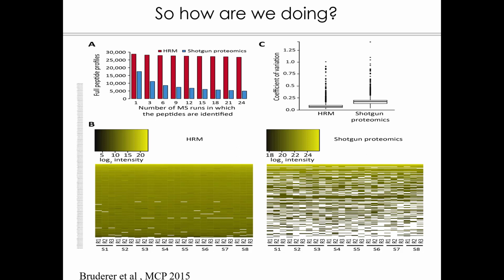So they call the DIA hyper reaction monitoring, HRM. Don't worry about the terminology. The terminology issue is a stupid one, but it's all the same. HRM, SWATH, DIA is basically the same thing under different disguises. Okay, so what do we see?